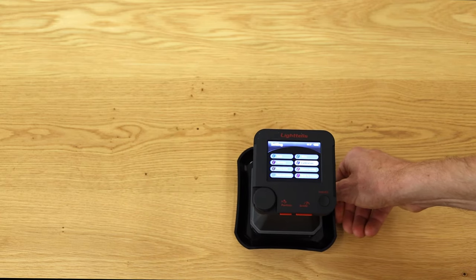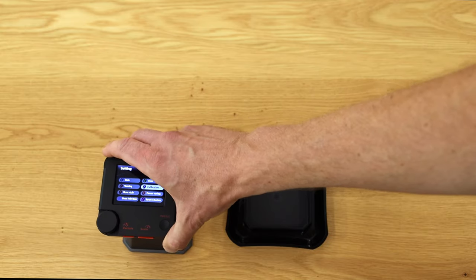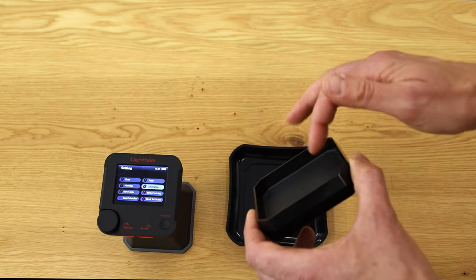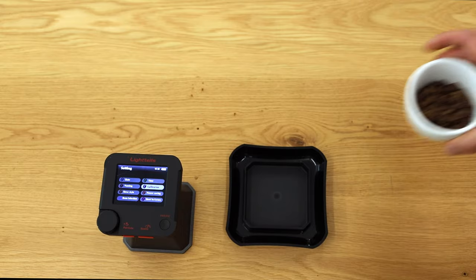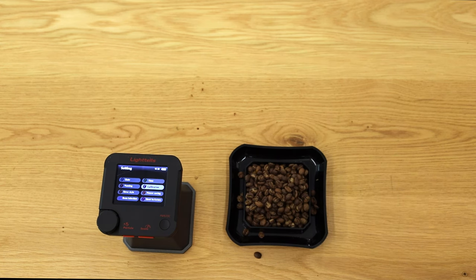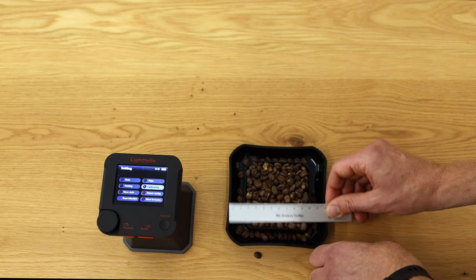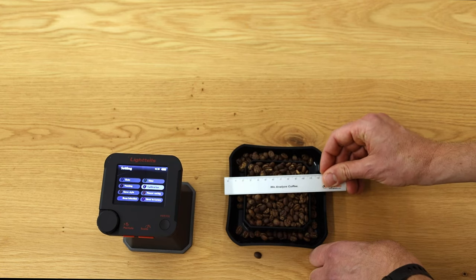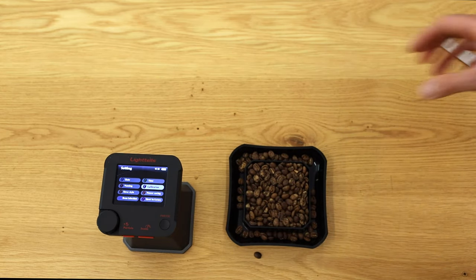Now we are going to work with the machine. First, I'll prepare a sample for color measurement using whole beans. I'm taking the deeper side of the cup so the beans fit properly. I distribute the beans evenly in the cup — the important thing is that all beans are in the cup and none are above the rim, so they are all evenly distributed and the sample is ready.